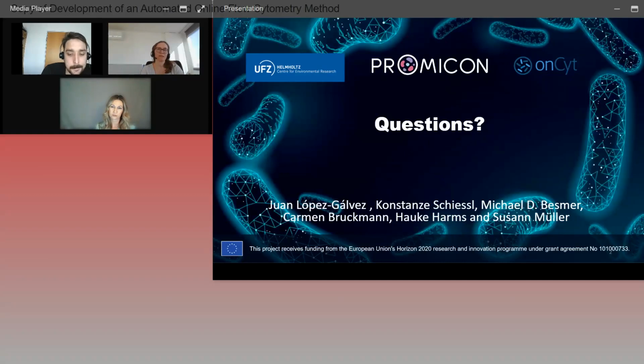So we see at least with this community that we tried here, that we have fairly stable signals. So any change outside this kind of more controlled experiment, I guess you would say it comes from a treatment, or maybe it could also come from ecological interactions within the community that change something about it. But I think the noise itself, I would not expect to be so big. I think that when you see changes, they come either from within the system or from a treatment.